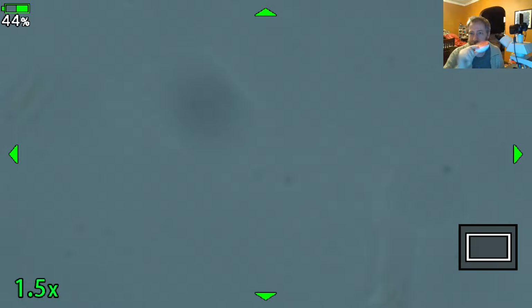What they will do is start to expand the diatom outward by adding more girdle bands. Those wrap around the outside edge, and they get bigger and bigger this way. Then it grows a new diatom valve inside the old ones, like that. Then these two split apart and make one diatom, and these two split apart and make another one. So essentially, each diatom gets one valve of the parent and one valve of the daughter. They do that just through binary fission.